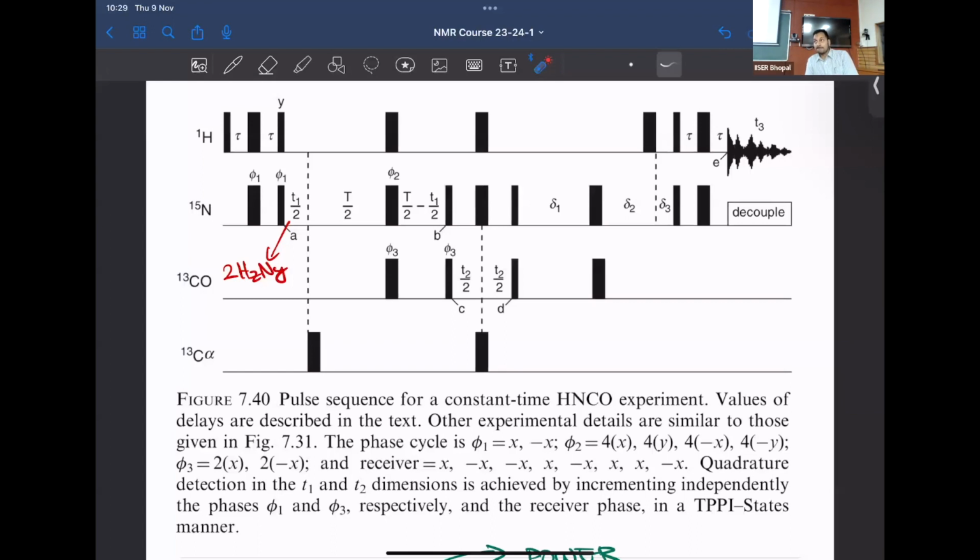Excellent answer. To reduce the time. Why do we want to reduce time? 3D NMR takes long time, so you want to reduce time. That's a more important reason than that. Remember, you're talking about few milliseconds here. Your D1 time is 1 second. So cutting 10 milliseconds is not going to make a huge difference on 1000 milliseconds, right? So yeah, it's 1% change. Your answer is right. You want to reduce the time of evolution. Why?